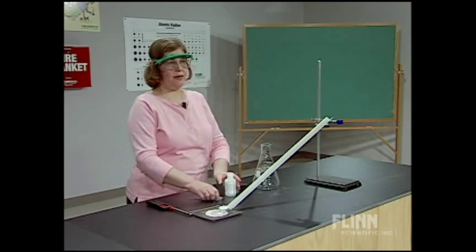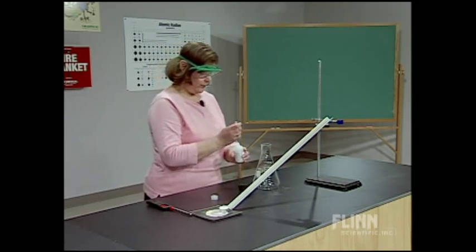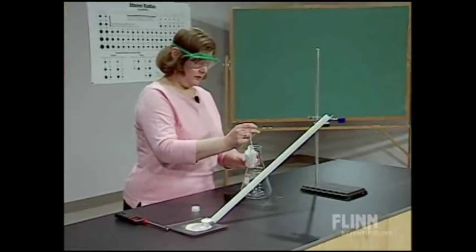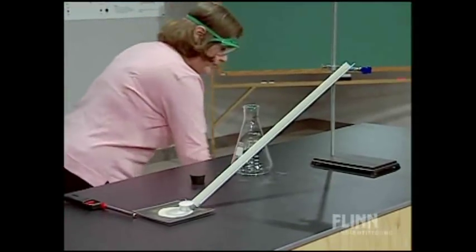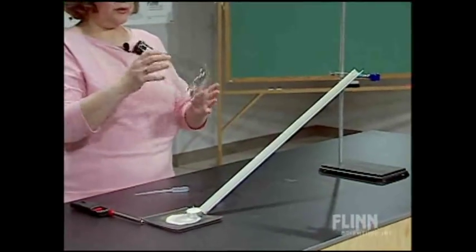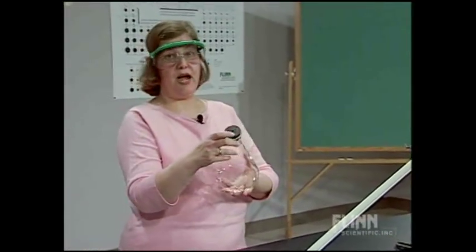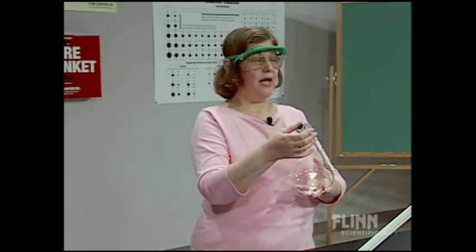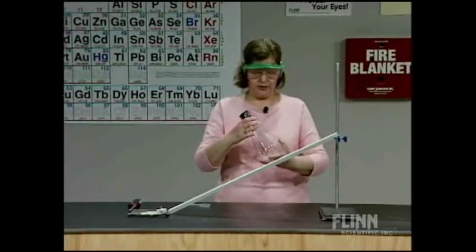What we're going to demonstrate here is the flammability of hexane vapor. Hexane is a hydrocarbon. I'm going to add about three milliliters of hexane to this large one-liter Erlenmeyer flask. I'm going to cap that bottle and put it away, then stopper the Erlenmeyer flask and swirl it a little bit. What I want to do is fill that flask with hexane vapor. This is actually a one-hole rubber stopper, which allows the air to escape and fill it with hexane vapor. I'm going to swirl it and let it sit for a while.